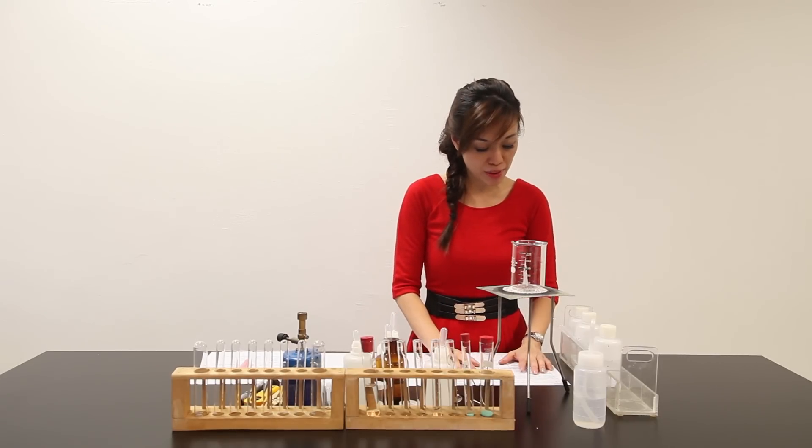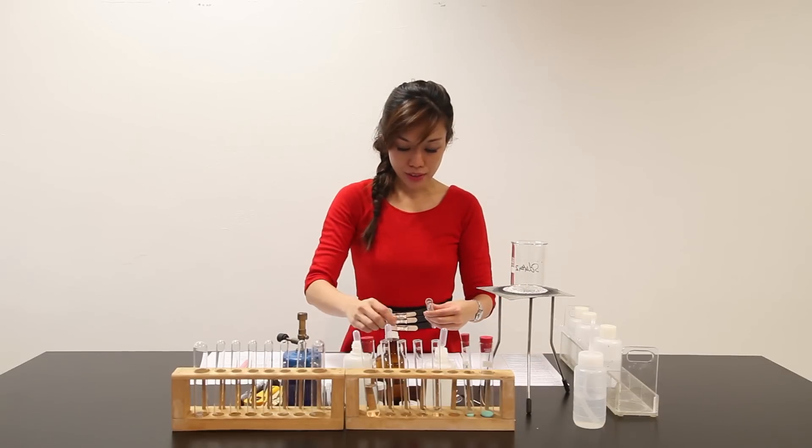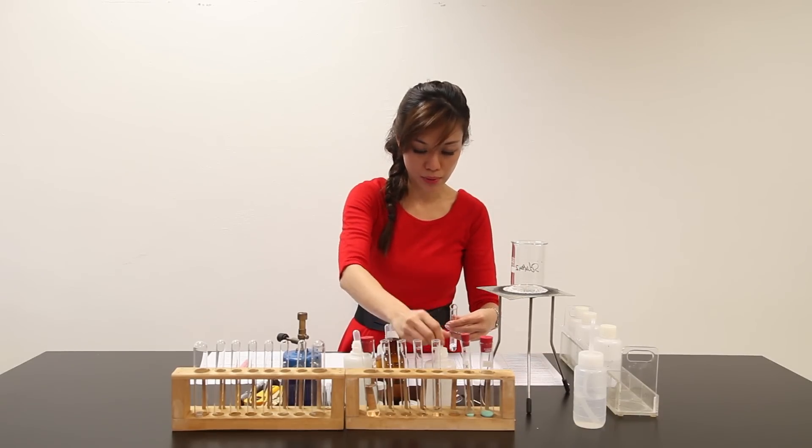Question 1 says: place about 3 cm³ of lime water in a clean test tube. This is number 1. Follow the marking — 3 cm³ of lime water.